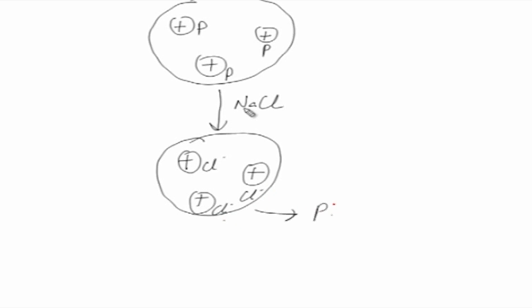Now, remember this protein is a mixture, so it will come out at different strengths of the salt. All right. Once this is done, you might get different peaks. Once it is done, then simply what you have to do is regenerate.